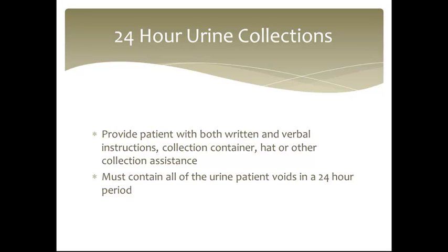If the urine is not collected during this 24-hour period, the whole process will need to be repeated. Upon waking up the next day, the first urination of that day goes into the jug as the last specimen. It is important to instruct patients to return these specimens to the clinic as soon as possible.